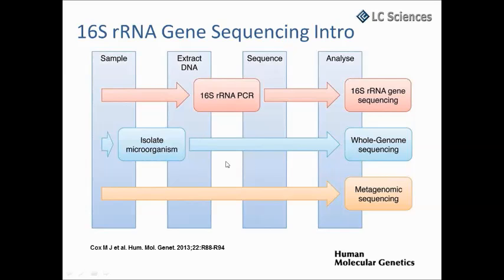And this is still working on single colonies, or maybe a single isolate.